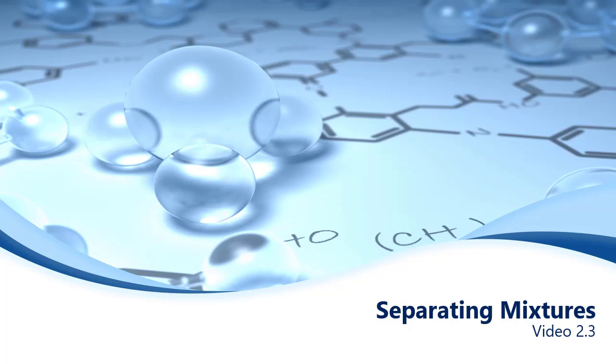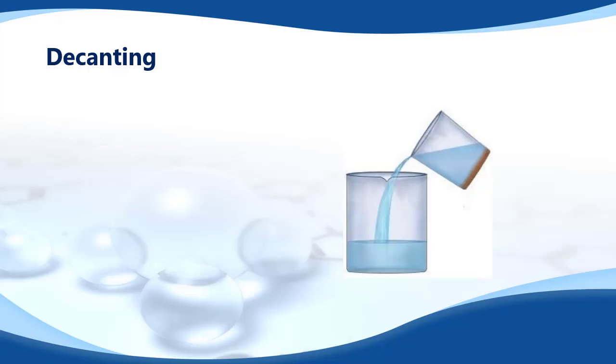In this video, we're going to be talking about 5 common laboratory techniques that you can use to separate mixtures into their individual components. These are not the only separation techniques that exist. These are just 5 common ones, and during the course of the year, we'll use 4 of them definitively, and I'll probably show you an example of the 5th. You will need your notes, you will need something to write with, and when you have those ready, let's go.